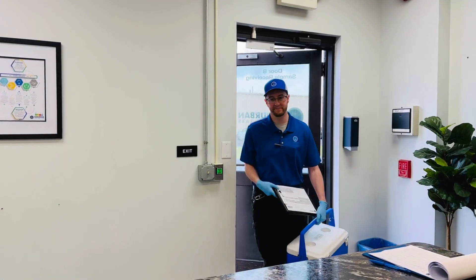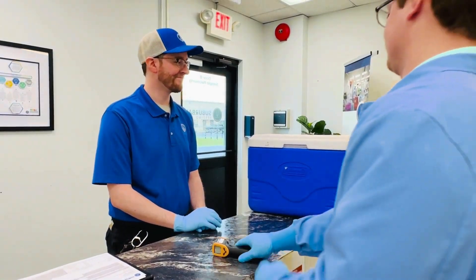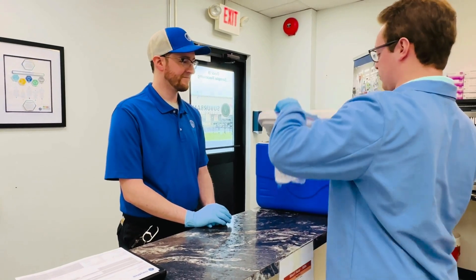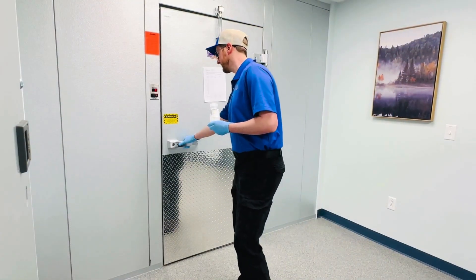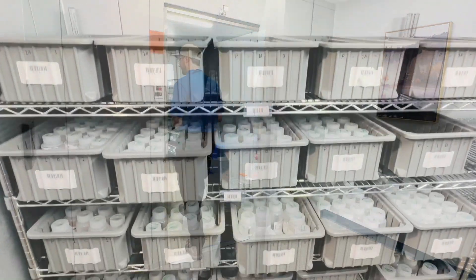After you or your Suburban pickup driver surrender samples to the lab, they are checked for proper temperature and chemical preservation. This ensures that the lab can provide you with accurate data by adhering to the DEP method requirements and our own internal SOPs. They are then refrigerated and stored in a logged location until they are ready to be analyzed.